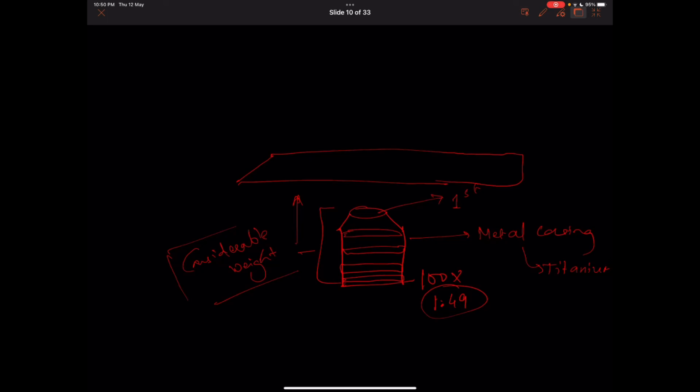Now, since this is a high magnification objective, we have already discussed that the high magnification objective has a working distance of around 0.13 to 0.16 micron. I hope I am correct here. No, it's actually mm. It's actually 130 to 160 micron. Okay, such a small distance.